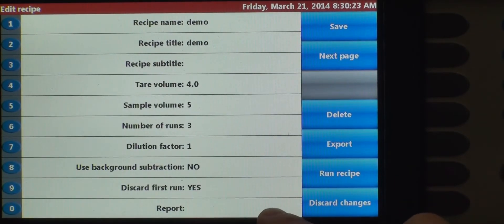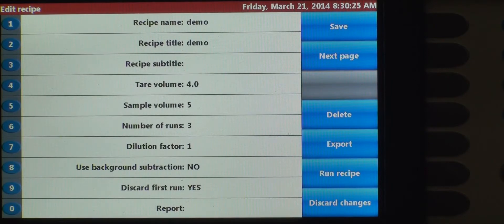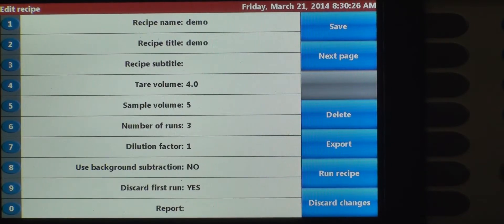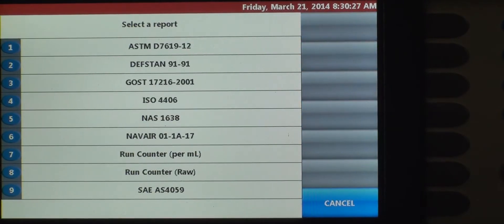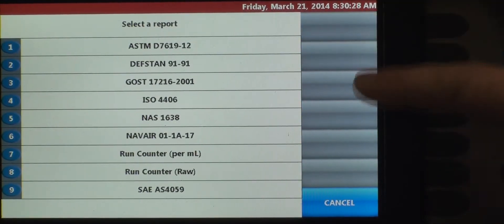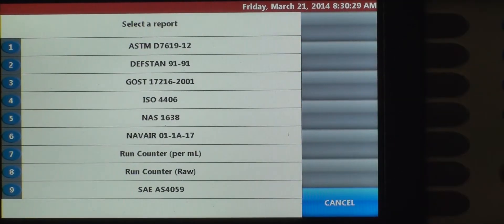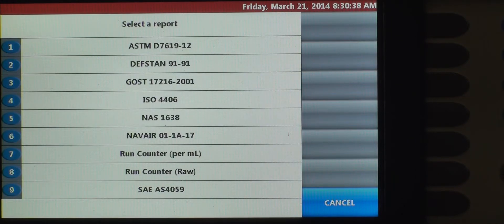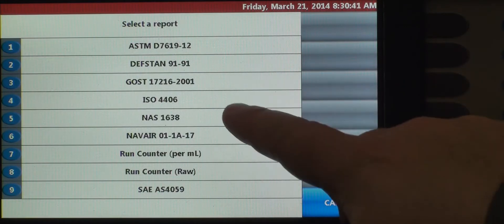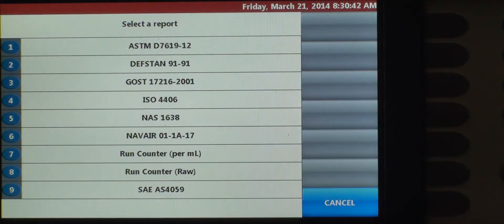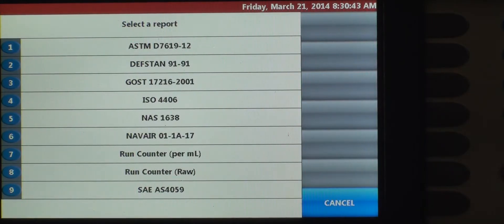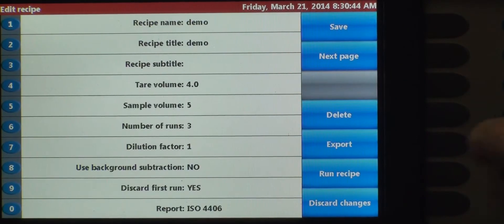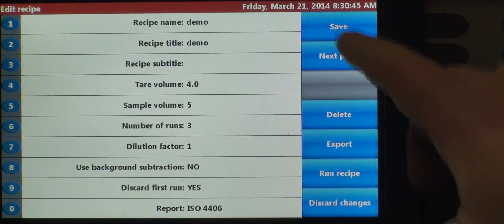Now we want to select which report standard we want to report out to. All of these reporting standards are preloaded in the instrument. Once you select the one that you want, when you run the data, the output will be in whatever cleanliness codes that you select here. We're going to do ISO 4406, number four.